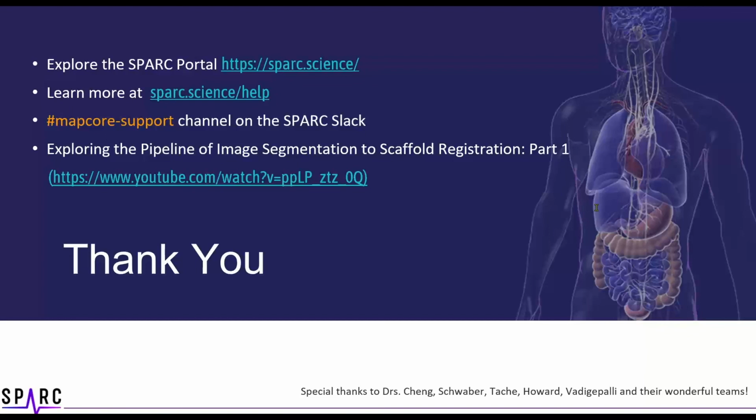In future, as data becomes more available, we can obviously provide that kind of information as well, depending on the research needs. It's completely possible, but it's just not on the portal at this stage.